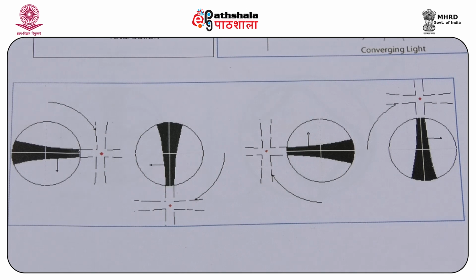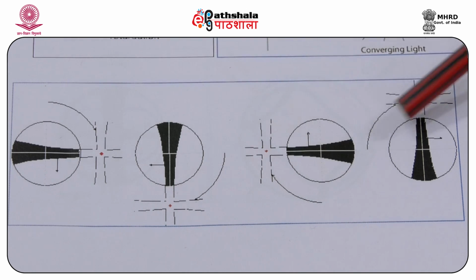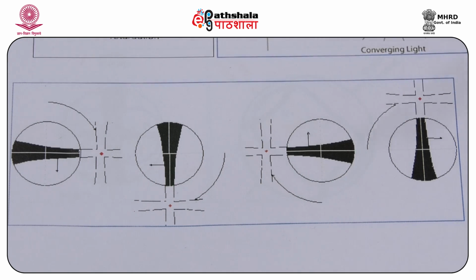However, if the optic axis is inclined more than 30 degrees from the vertical axis, the melatope will lie away from the field of view, and the interference figure is called an off-centered figure, and the four isogyre arms will sweep across the microscope stage as depicted in this figure.